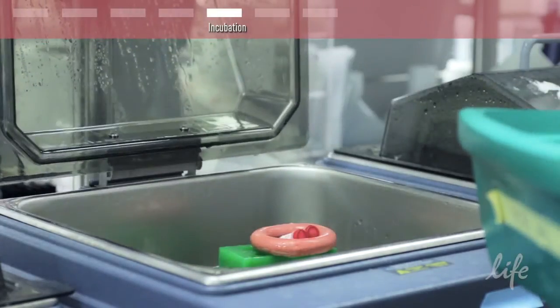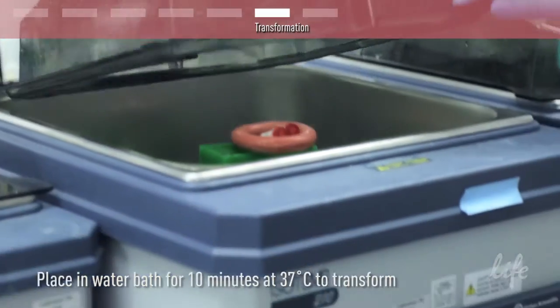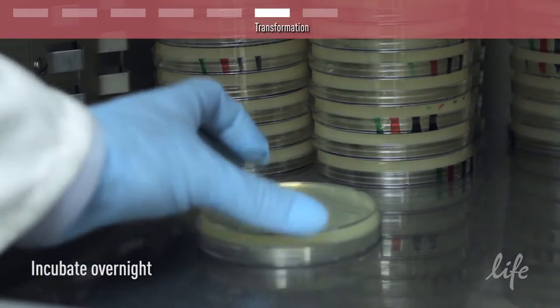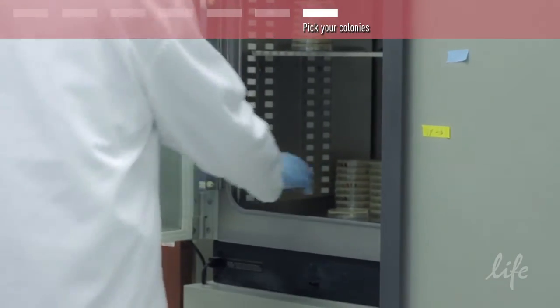Now that the assembly is complete, it is time to transform the DH10B competent cells provided in the kit and incubate them overnight. The next morning it's time to pick your colonies. We recommend picking four to five colonies.